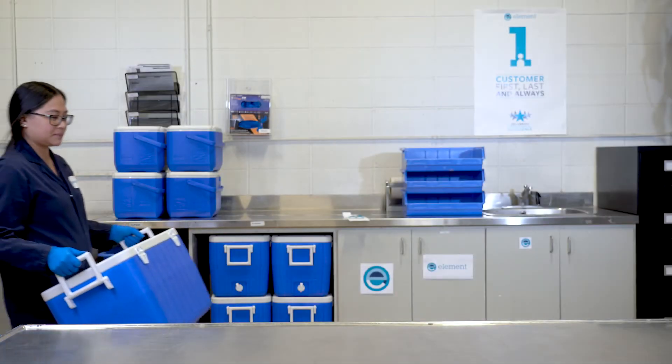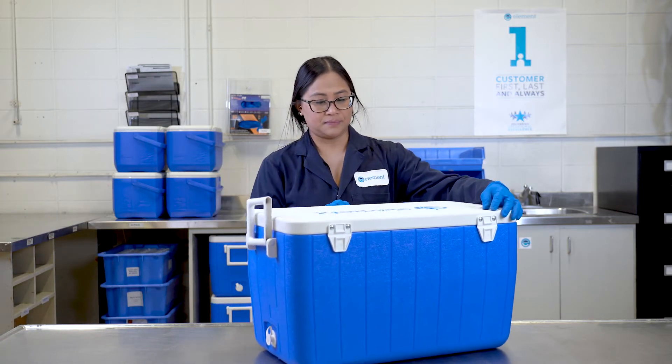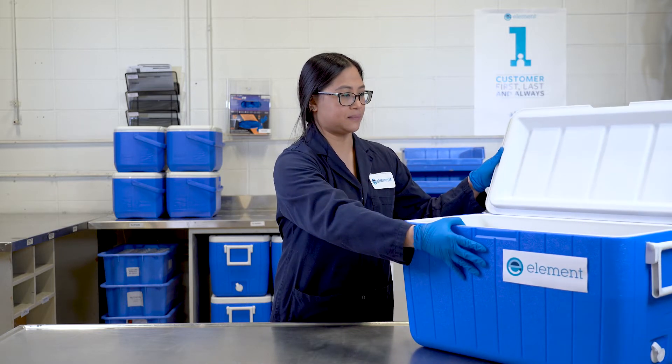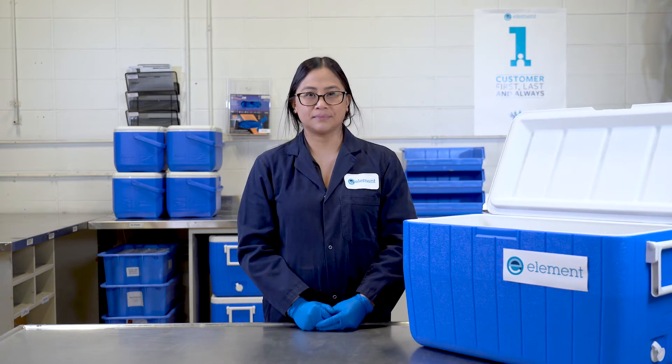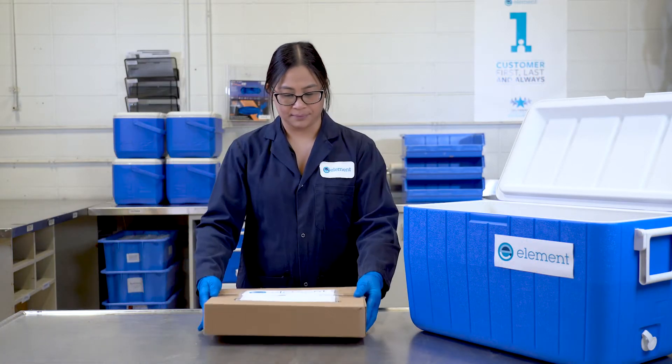When packing a soil cooler, the most important thing is to not overload the cooler. Try to limit the total weight to less than 40 pounds — anything over 40 pounds is considered unsafe. It's a safety risk for the person taking the samples, the courier transporting the cooler, and for the staff receiving samples.